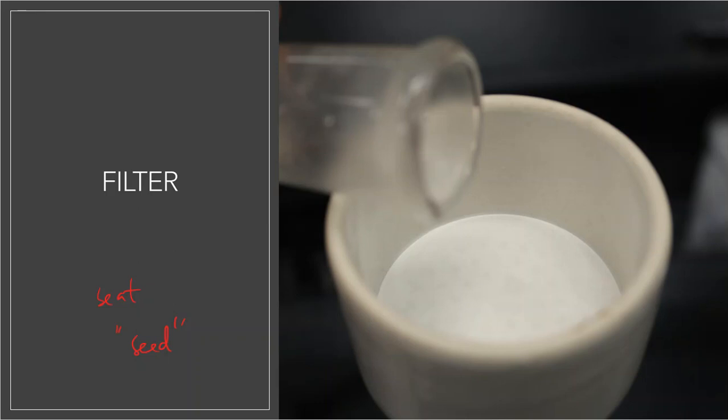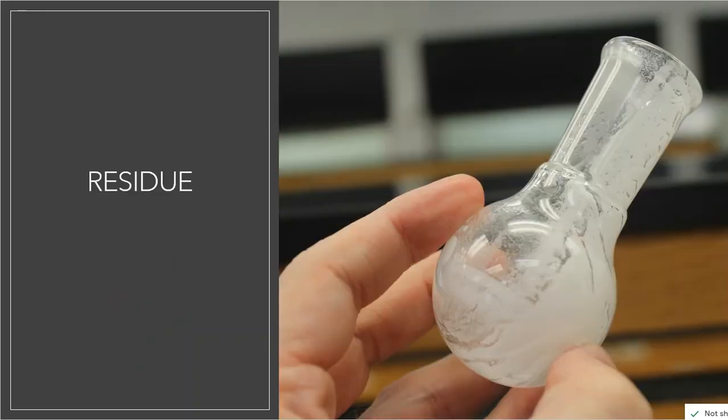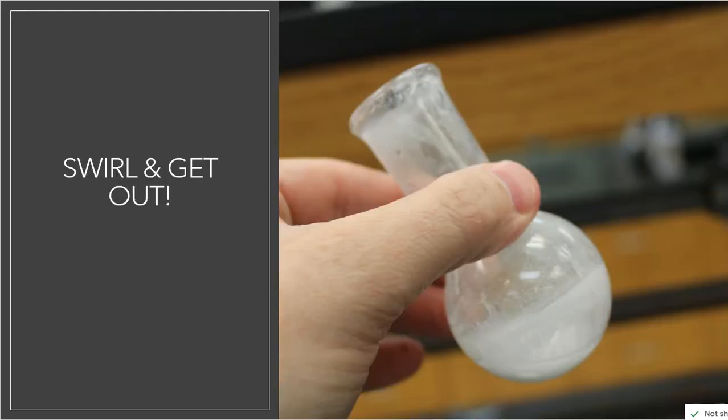All right, so after I seat the filter paper with solvent, proper solvent, that helps me create some suction on that filter paper. It stops up the holes. I get ready to pour my solution through. I do have some residue that's left over in the flask. I'm going to have to get all of that out of there, right?